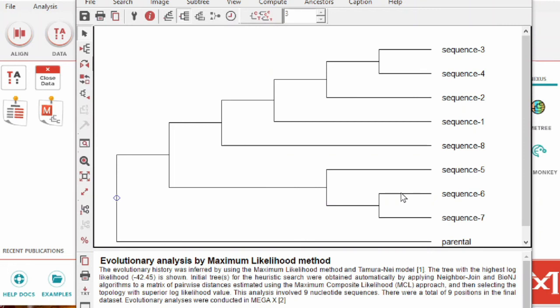Okay, so at that point, I would like to ask you to analyze your own data, the ones which you generated while playing the game. Please analyze the genetic distance matrix and see how consistent it is with your expectations.